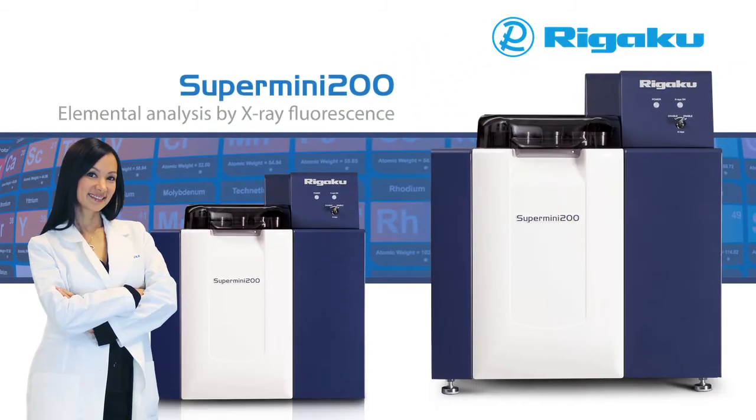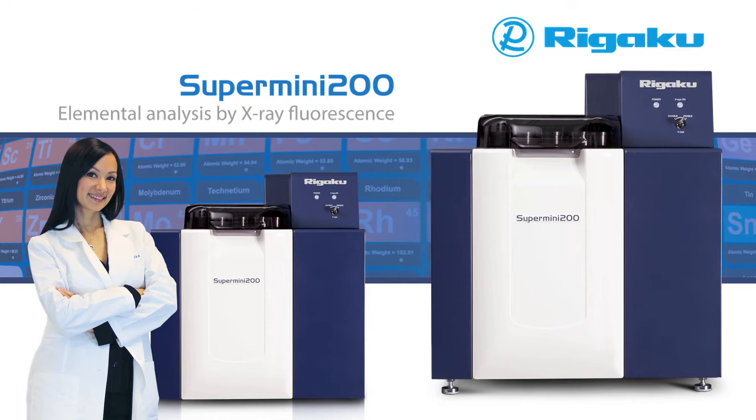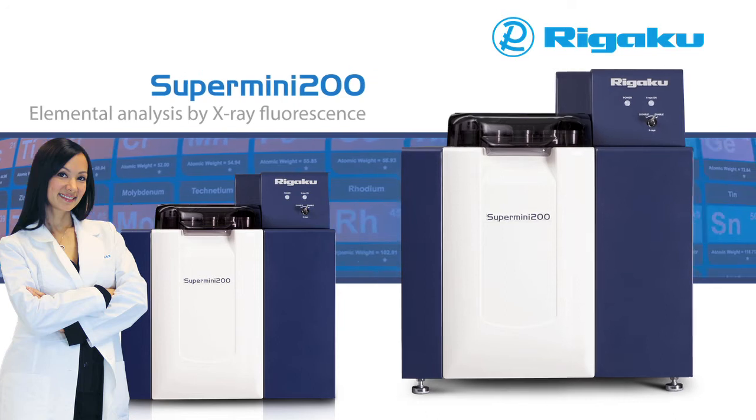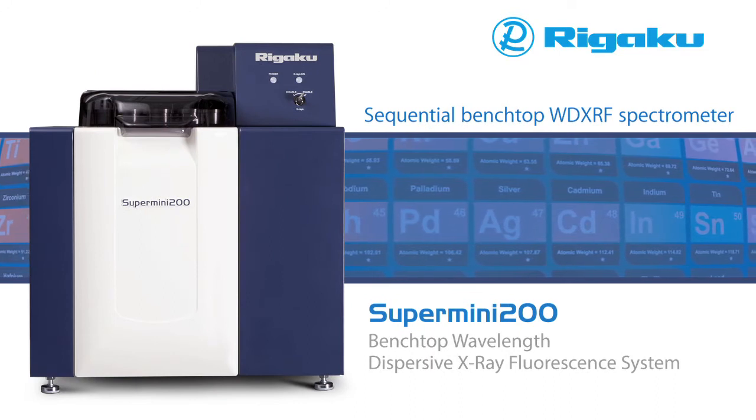The world's most advanced benchtop XRF spectrometer advances even further. Rigaku is proud to introduce the new Supermini 200, an improved version of the Supermini, the world's first high-performance benchtop WD XRF spectrometer.